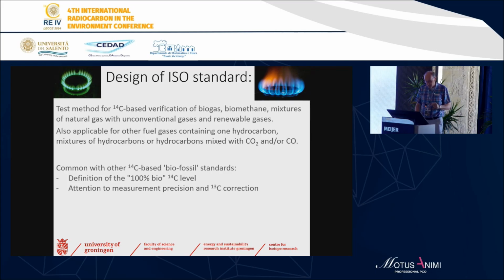Anyway, we published on this a couple of years ago. What is different? That is the sample pretreatment. So we have to prescribe a way of performing and testing complete conversion of all the gas components.